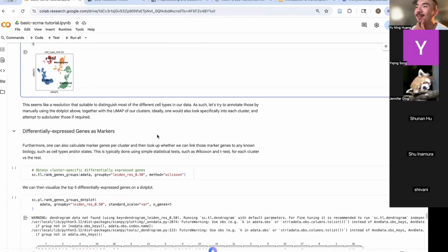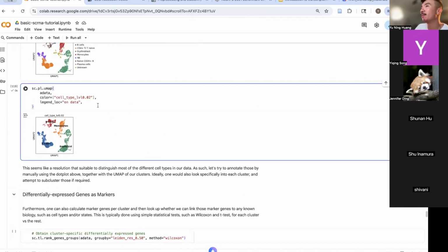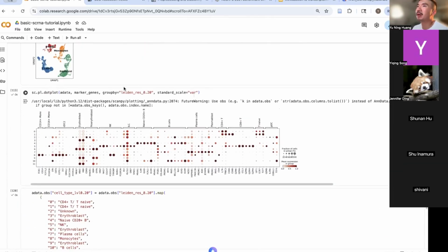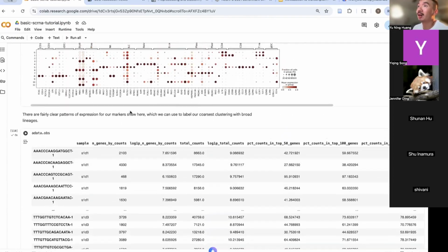Yes. Okay, yeah. So I would say this is the basics. I think a lot of the time, even in publications, they would just start from here and stop here if they really don't want to dig that deep into single cell RNA-seq. They just want to show how they identify certain cell types, for example. In our project, we want to look at if there are stem cells, so we will use stem cell marker genes here.